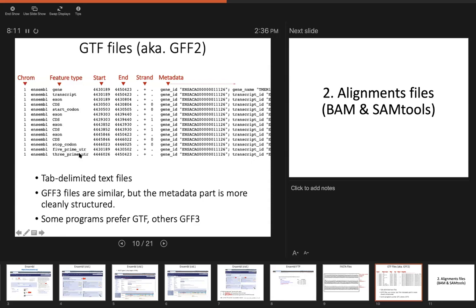other parts of the exons are actually, in this case, annotated with UTRs, right? If you're working with non-models, it's not always going to happen. In mice and human, hopefully it will. And then this is just where the gene and the different exons are. That's basically the start and end position on chromosome 1. So if we look at the start codon, for instance, it's from something 503 to something 505, so that's over 3 bases, which is what we expect from the start codon. And then we have the strand the gene is on, and then some metadata, so just the gene Ensembl ID in this case, and then the gene name.